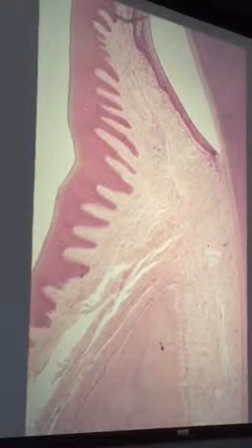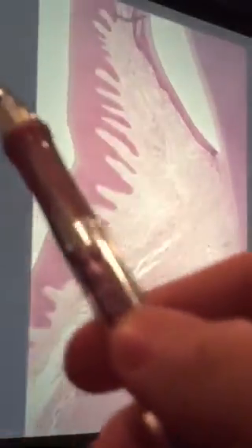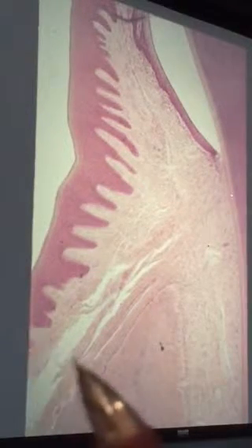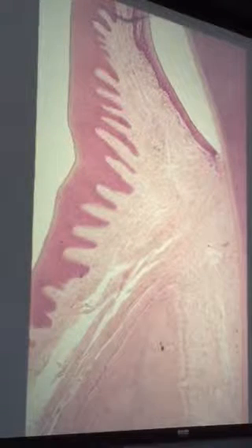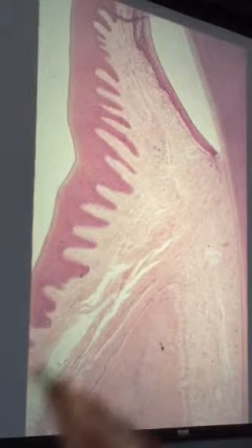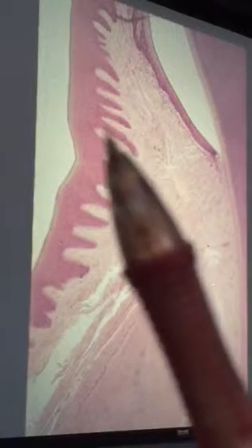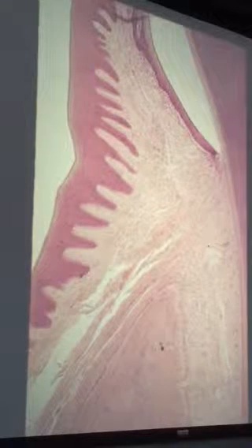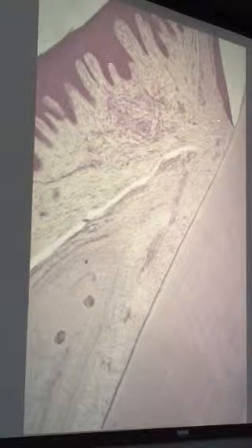We have the gingiva out here, and then we see some fibers that start here and keep right on going. Those are what? Periosteal fibers, and these would be what? Dentogingival fibers. And how about the fibers we see right here? Alveolar crest fibers, and then the horizontal fibers don't really show quite that well. And so we've got more horizontal fibers right here, and those little lines we see there and there, what are those? Sharpey's fibers. Right, and there are those dentogingival fibers on that slide. Show up rather nicely right there.